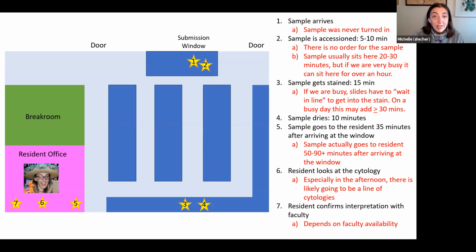And so for things that are not statted, I'm just going to wait until they're out of class. When things are statted during normal hours, then some of these steps we can usher the sample through more quickly, and that's what that stat is for. You basically are cutting the line in every way.